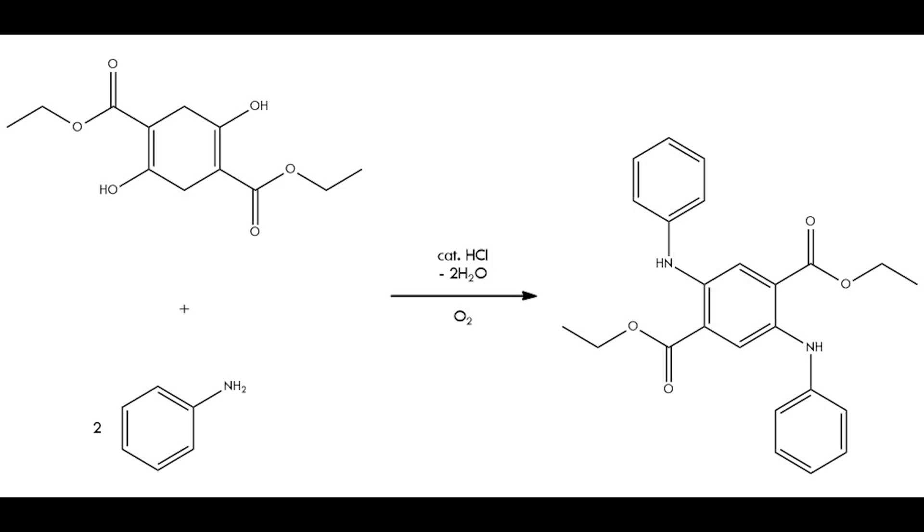Welcome back. In this video, I'll be synthesizing diethyl-2,5-dianilino-terephthalate from DESS, or diethyl succinylsuccinate, and aniline, using a small amount of hydrochloric acid as a catalyst and toluene as a solvent.